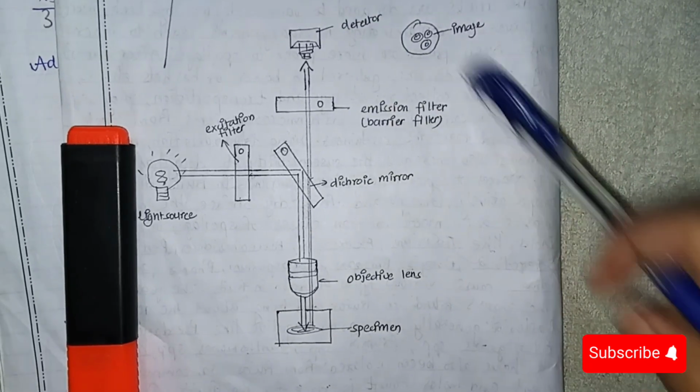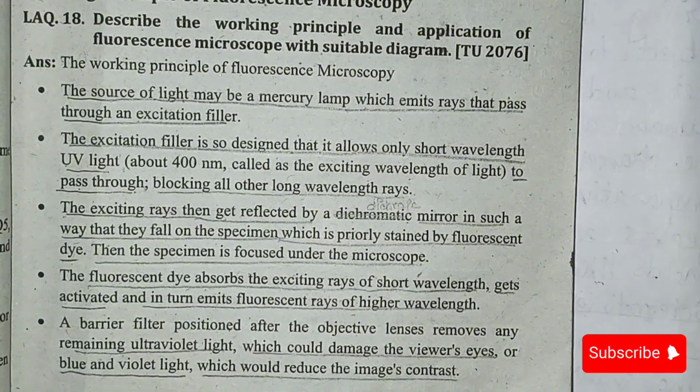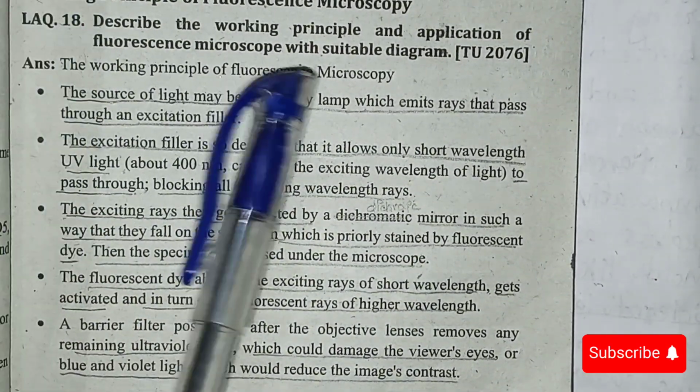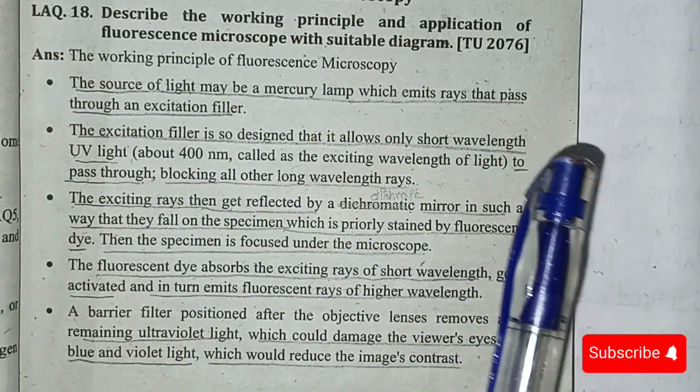Now we are going to study what is the principle of fluorescence microscope. What is its principle? In fluorescence, as we have already studied, how does it work?